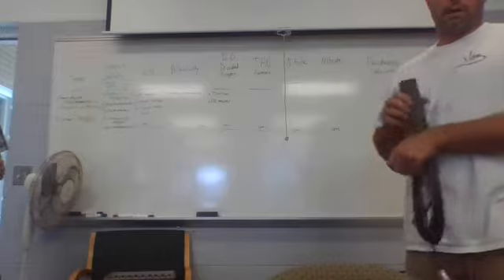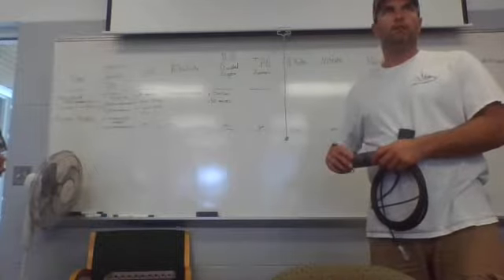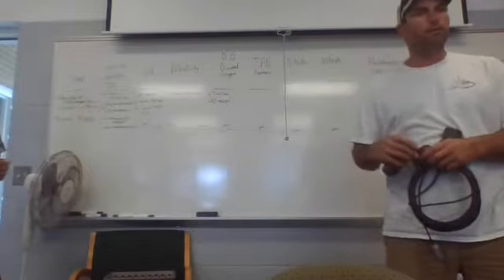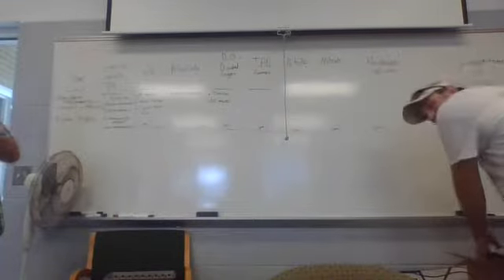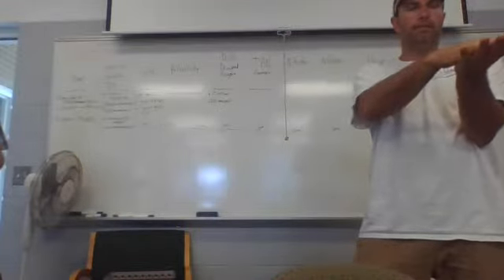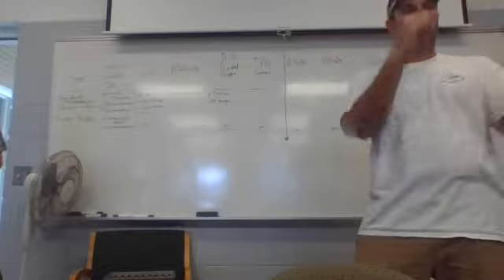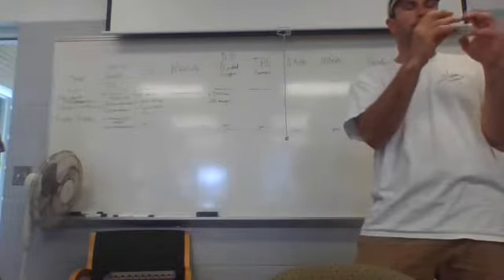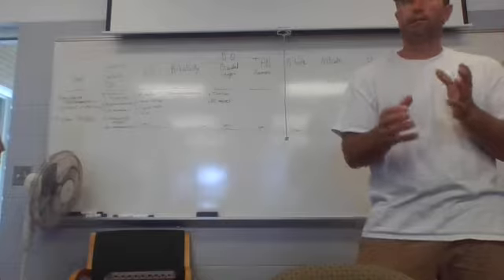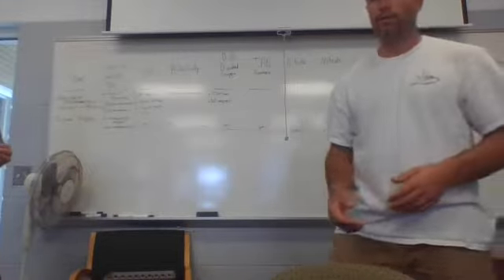So there's a few different types of membranes that are out there. There's the galvanic membranes, and there's polarographic, just different configurations and different materials used. With those meters, there's an ionic solution that you set on top of the electrode, and then you stretch a plastic membrane with very tiny holes in it across that, and then it measures, and it can pull oxygen out of it. So you have to calibrate it. It takes a long time to warm up. You have to change those membranes, and it's kind of a pain in the neck to work with.